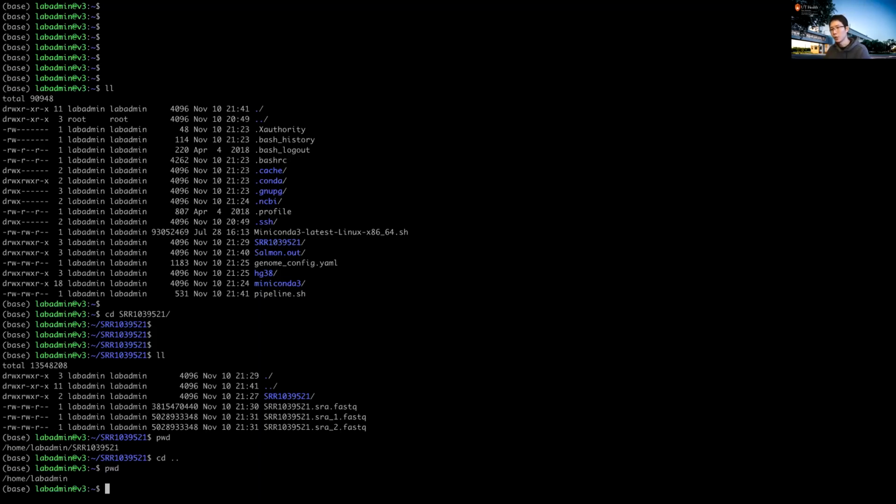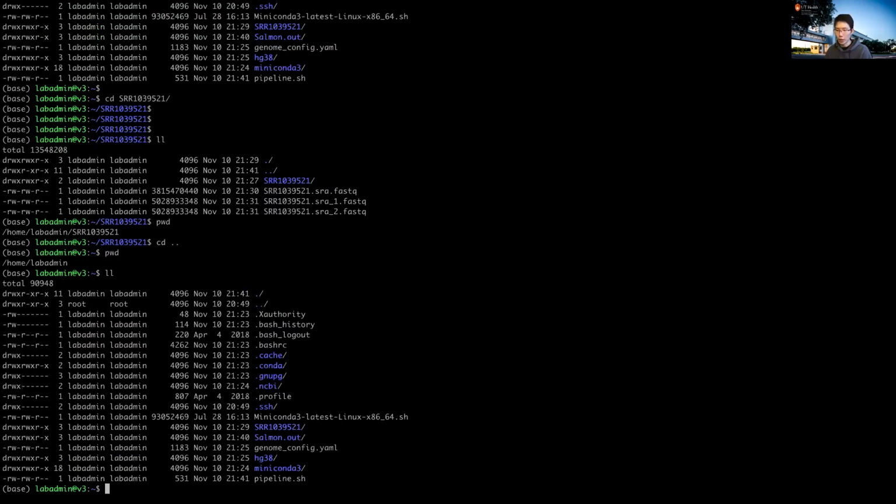Okay, so we use cd .. to go back to the previous upper directory, and if you want to enter a specific directory, you can see which directory you want to enter, and then cd to the directory. So that's how we change directory.